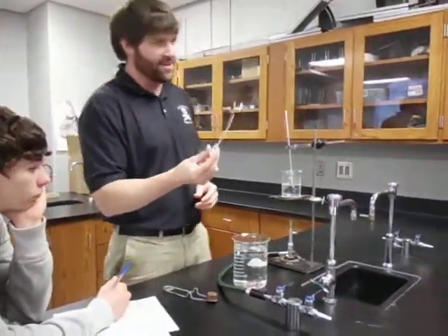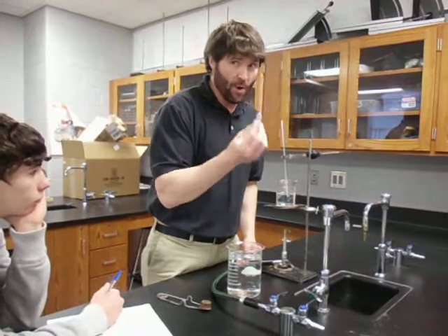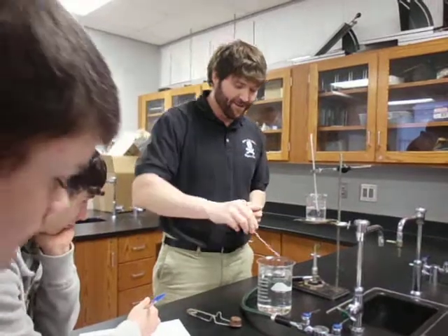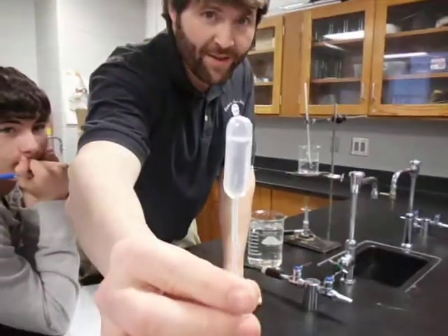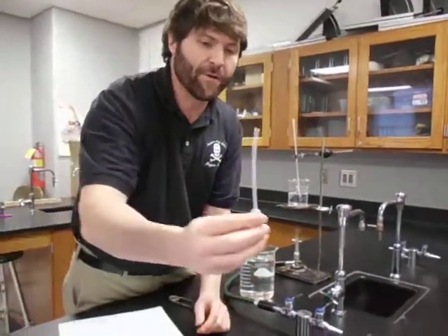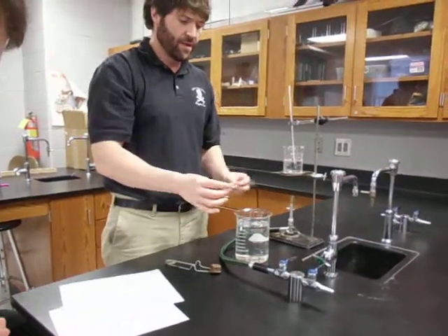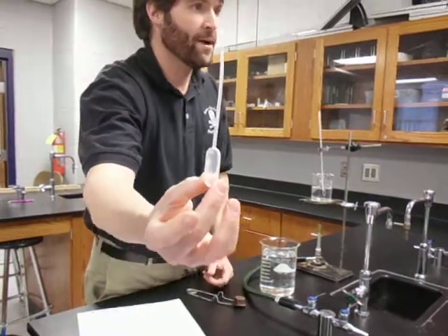Now comes the fun part — one of your lab partners can get started on this right away. We need to know the volume of this pipette, which means we need to know how many drops of water this pipette will hold. Someone has to count how many drops are in it. We'll stick it in the water and let go, but notice it doesn't get completely full — there's an air gap at the top. So we'll flip it over, squeeze the air out, stick it back in the water, and let go. Now there are no air bubbles left in it whatsoever.